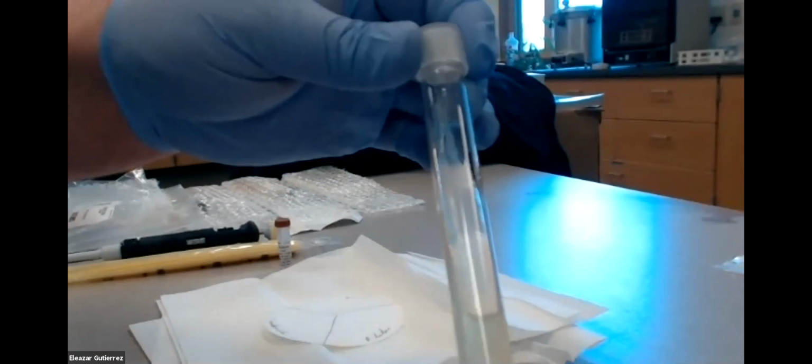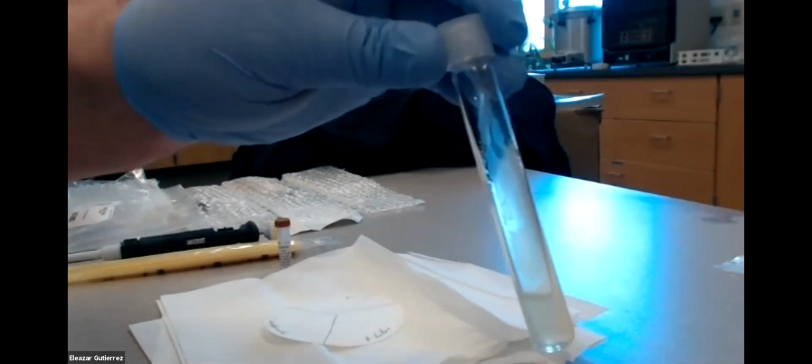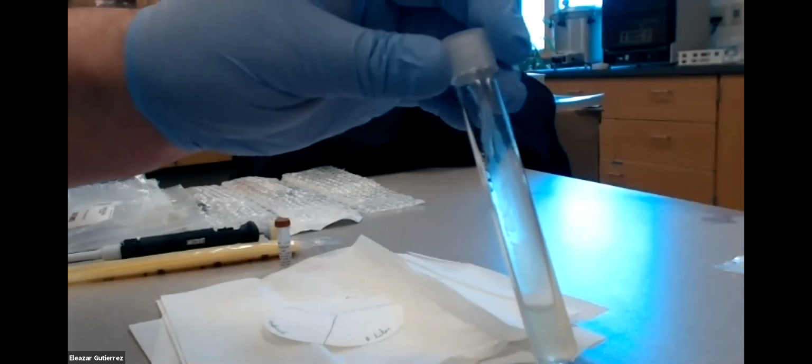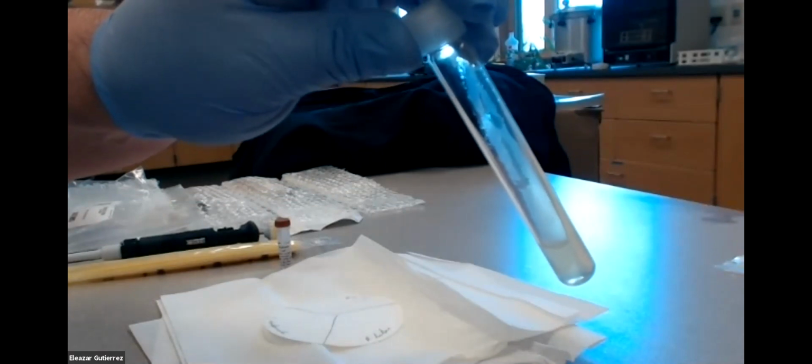But if you put it there, within 24 hours, you'll have a nice turbid broth or a nice, well-defined colony like this one, or not colony, but carpet. I can see it here, so I know you guys should be able to. Look at that. That's beautiful. So anyways, does it need to come from the TSI? No, it does not.